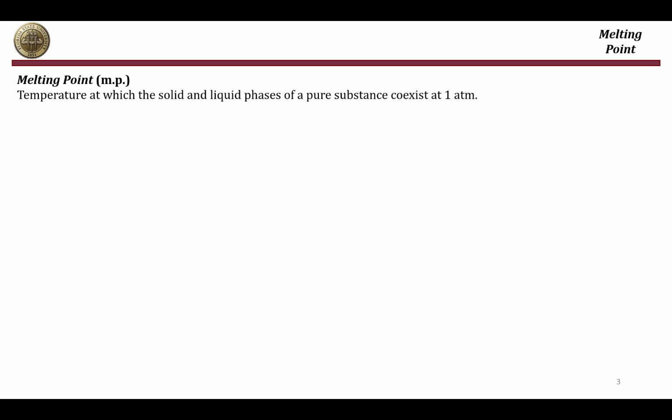If you have a solid compound and upon heating, this solid compound will start to melt or move from the solid state to the liquid state. Once both states occur at the same time, this is called melting, and the temperature at this point is called the melting point.